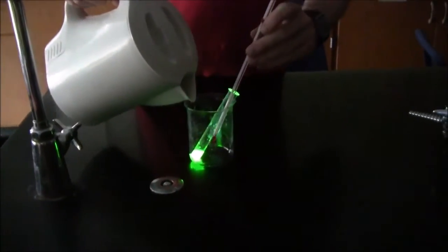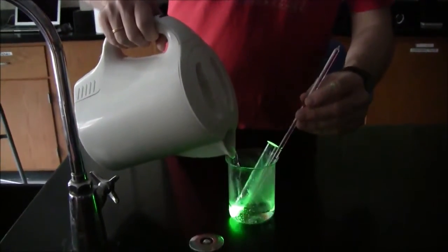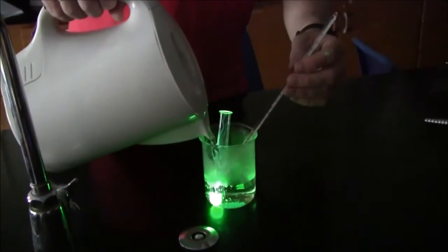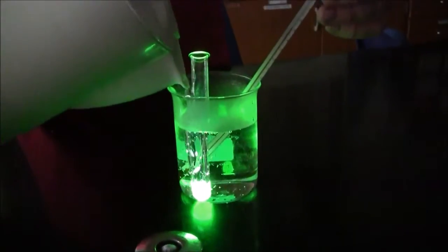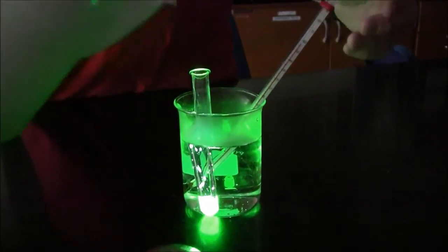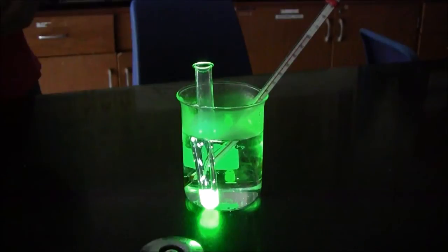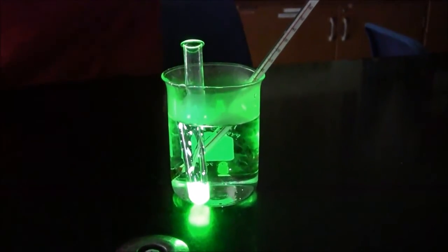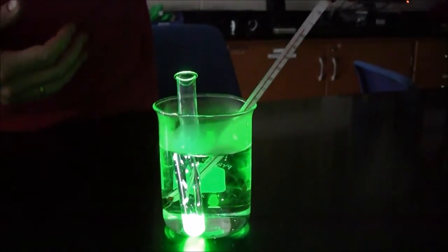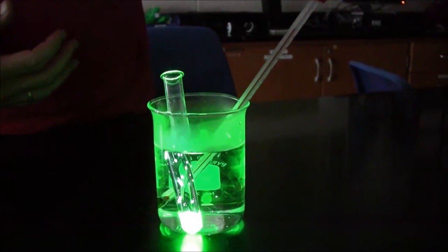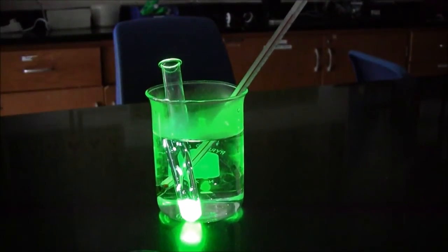Now I'm going to add some hot water. I want to get the glow stick up to about 50 degrees. Notice how it glows more intensely as the temperature has increased. OK so that's about 60. So I'm going to want to make it a little cooler.